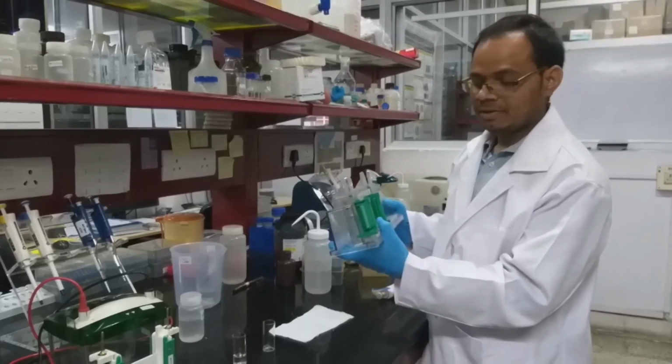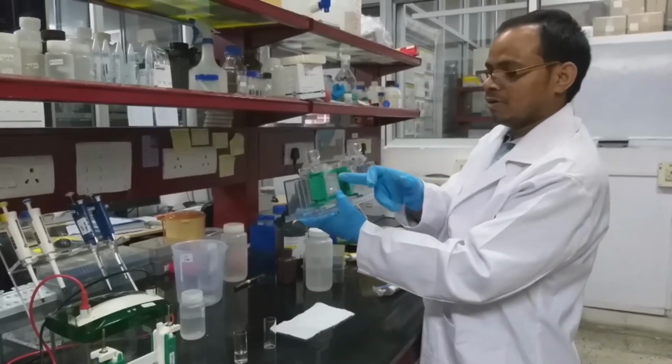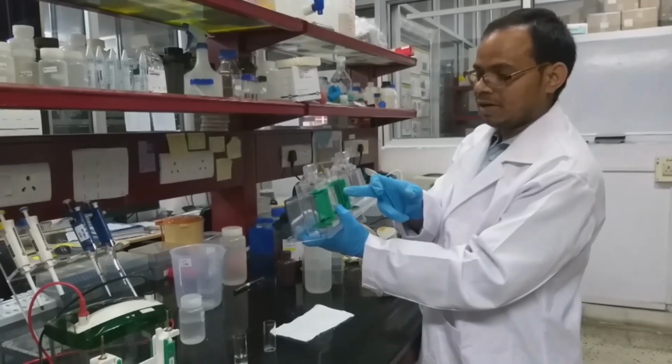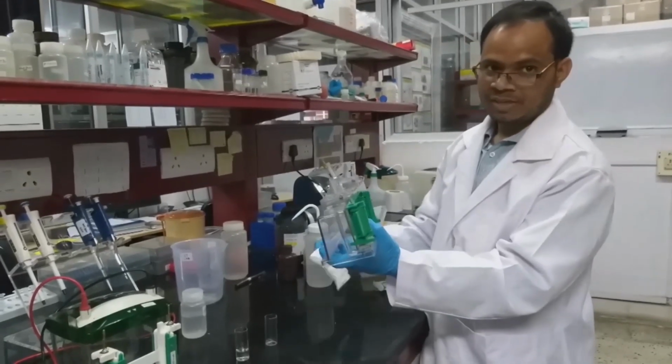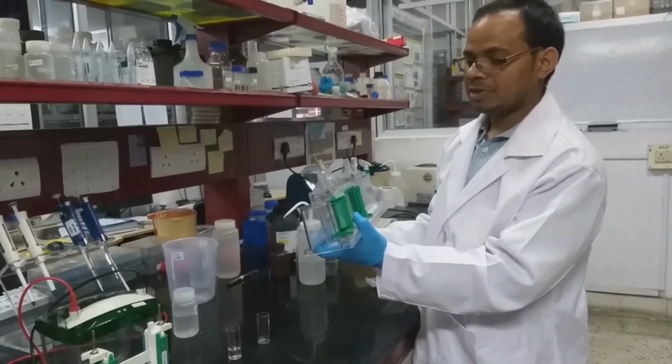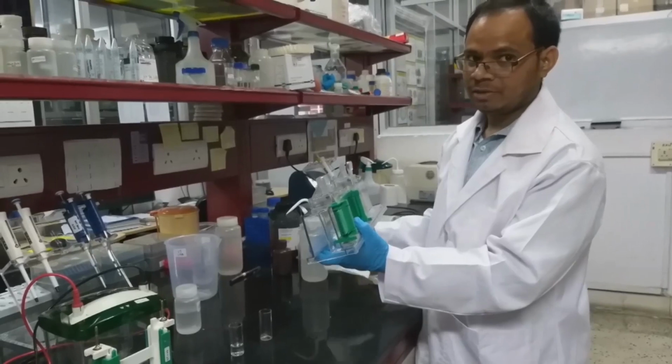It is solidified. Now we have to remove the overlay layer. Like we have used water, so no need to remove. If you are using isopropanol or butanol, you have to remove that and wash with water.